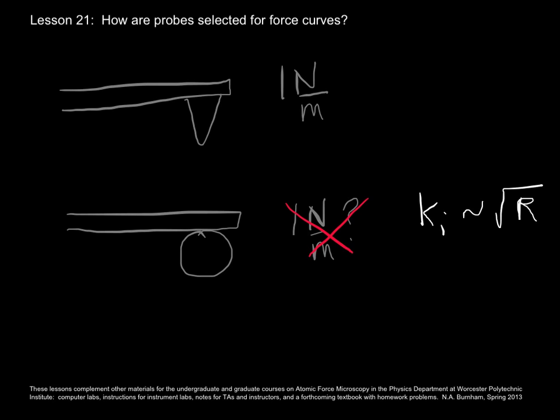In summary, for this lesson, I've talked about probe and tip selection for force curve acquisition, and also how those choices are related.